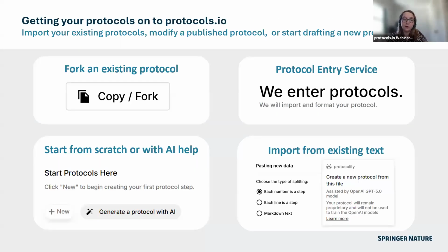To get started on protocols.io, if you haven't already, there are a lot of different ways to get your protocols on. You can fork an existing protocol. You can use our protocol entry service where we will import and format your protocol for you and then transfer ownership to you. You can start a protocol from scratch or with the help of our generative AI, which is trained off of Springer Nature scientific materials and is specifically trained for scientific experimental use.